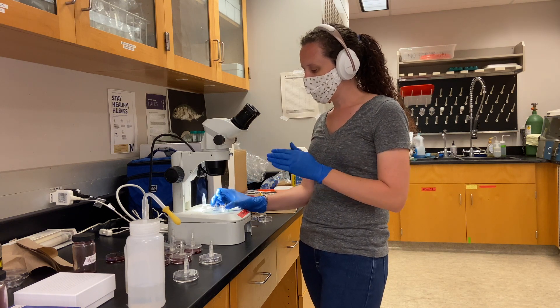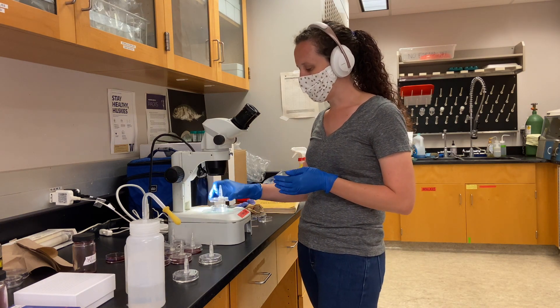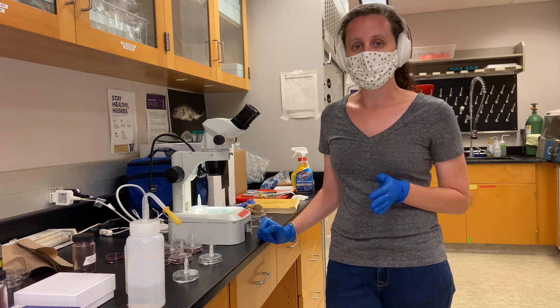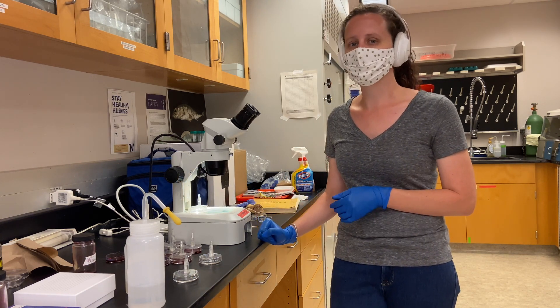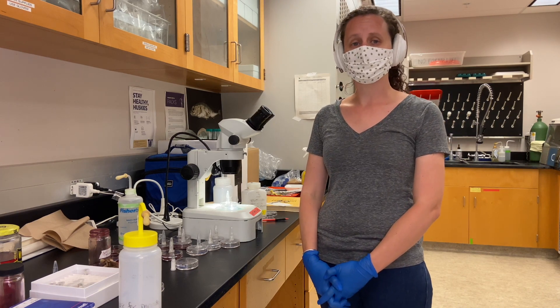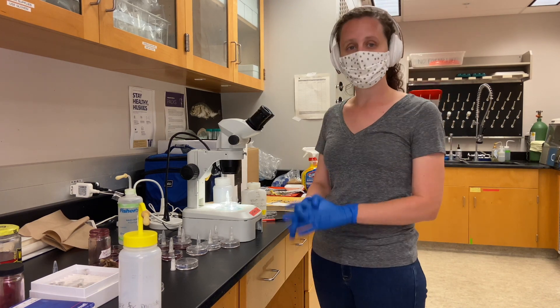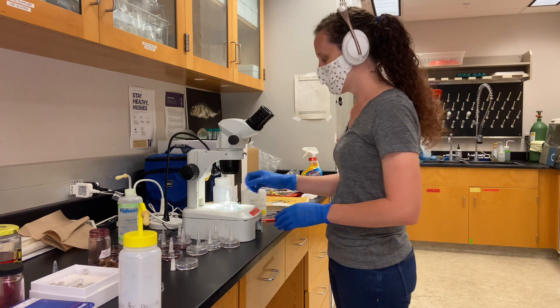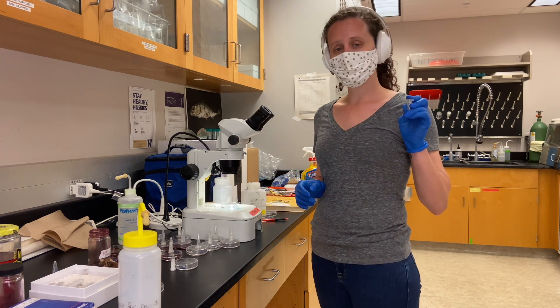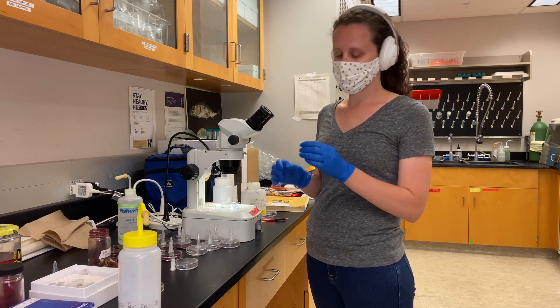I'll swirl it a little bit and then let it sit for about 5 to 10 minutes — 5 minutes for smaller specimens, 10 minutes for the larger specimens. After the specimens have been sitting in the sodium bicarbonate solution for about 5 to 10 minutes, I'm going to take the specimens out and put them back either in their original tube or a new one with 70% ethanol. They can stay in the 70% ethanol indefinitely until you're ready to dehydrate and mount.